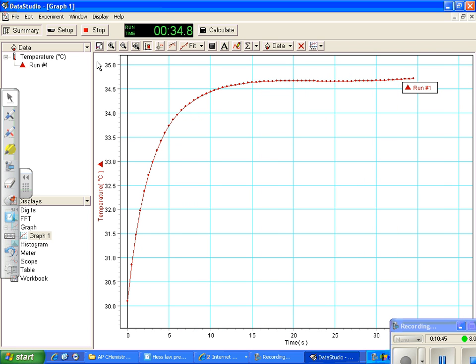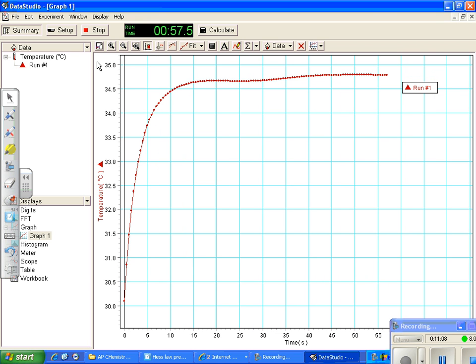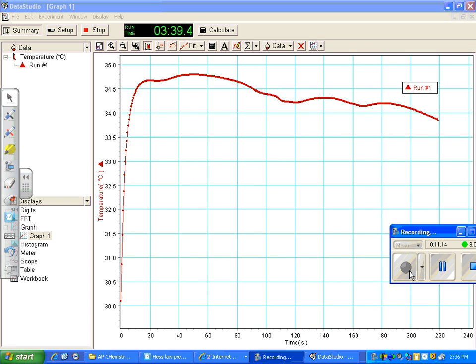Cooling is a linear function. So you're going to let it run for a while, and you will actually generate it. You're going to do it for about 3 or 4 minutes. And it will start to slope downward after a little bit. It's only been a few seconds. Your reaction will be a little hotter anyway. So I'm going to pause it for a second, let it run, then I'll come back to it.